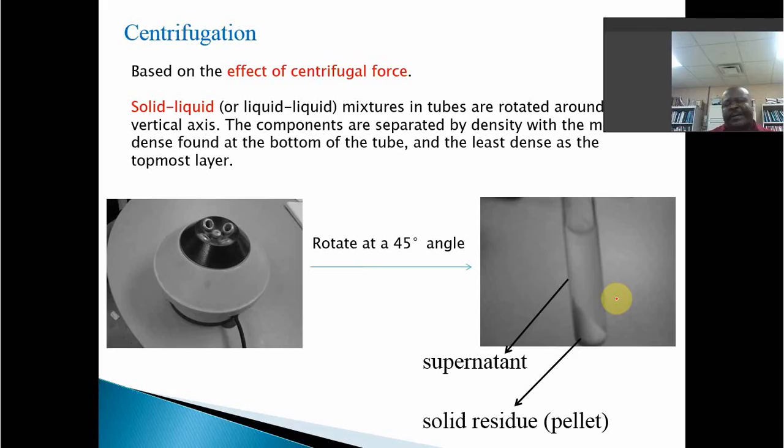So centrifugation, that's based on rotation. If you take a test tube and you have a mixture in there, solid particles, whatever it is, if you were to rotate it high spin, then the particles are forced to the side and pack to the side. In our case, here's our centrifuge unit. These are the units that we're going to put our sample in. And there are four of them here, and they're sort of at 45 degrees. This thing rotates quite quickly.